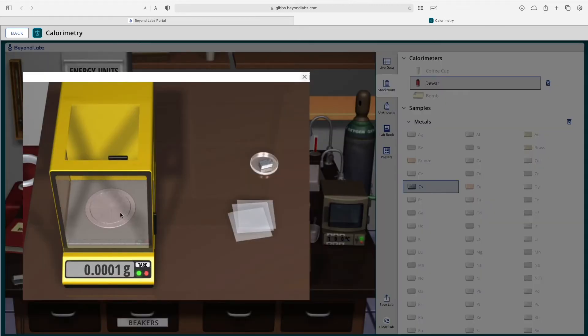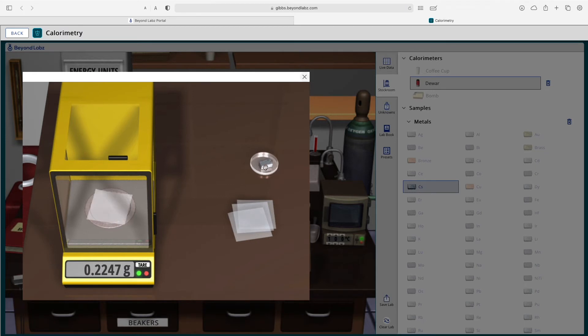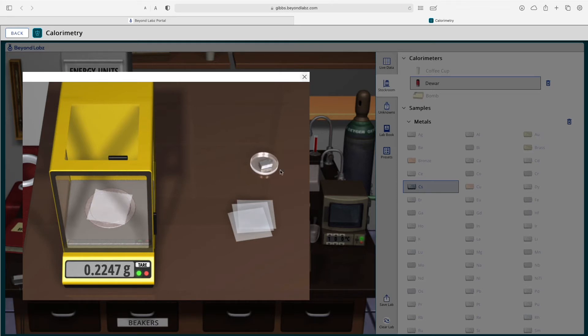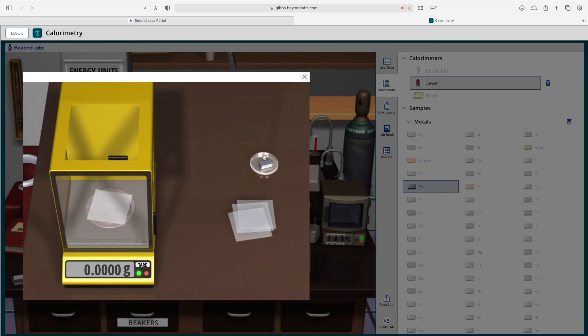You can click on the balance and add weighing paper. You can weigh out any solids you might have. Let's go ahead and weigh this cesium. Notice that I didn't tare. You'll want to keep in mind that this acts just like a real lab.